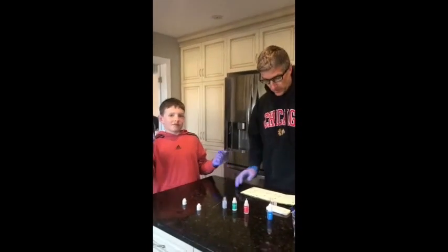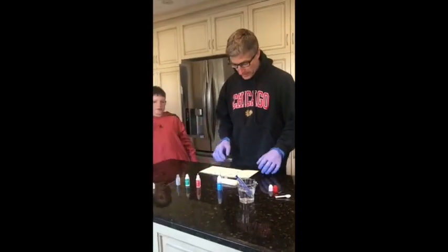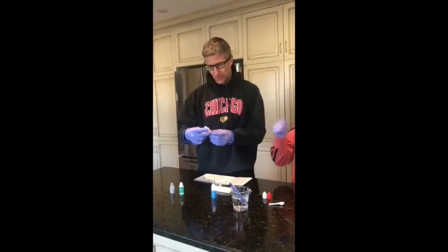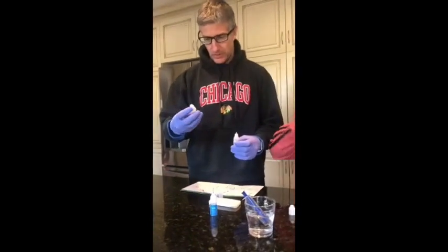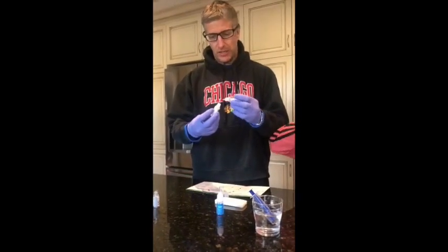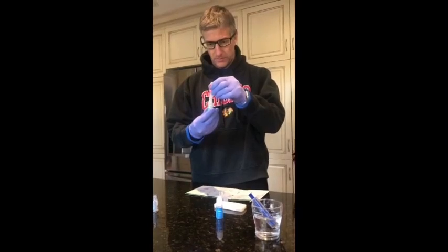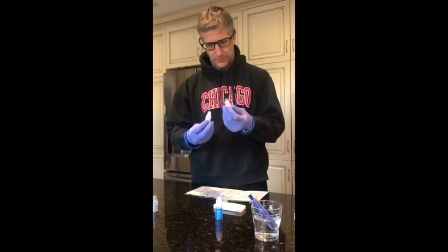Yeah, I am. Okay, so while Duncan's doing that, I'm going to prepare the second solution, which we have tin chloride, and we're mixing some NaHSO4 into that. The name of that is sodium hydrogen sulfate. Okay, so taking the tin chloride and we're mixing the sodium hydrogen sulfate into it. This is hard. Not happening. This is so hard. Why is that not happening?